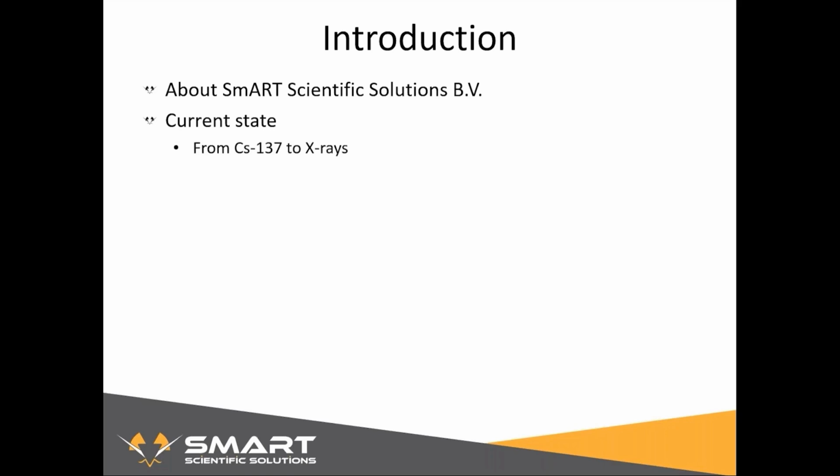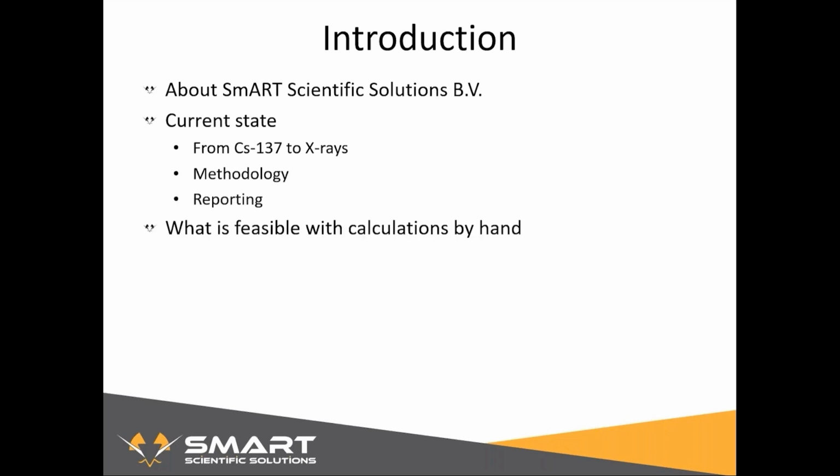One is a discussion about the transition from cesium-137 to X-rays. Then I'll talk about the methodology of how the dose is usually calculated and the reporting. After that, I'll have a look at what is feasible when doing hand calculations without any advanced tools. And then I'll finally introduce our software solution, SmartRad.